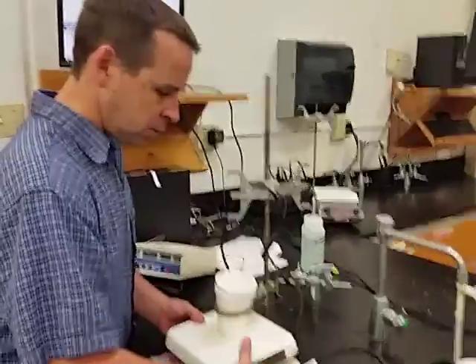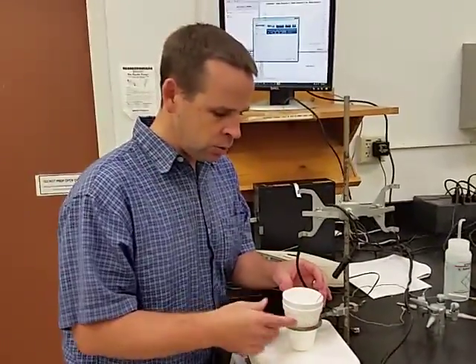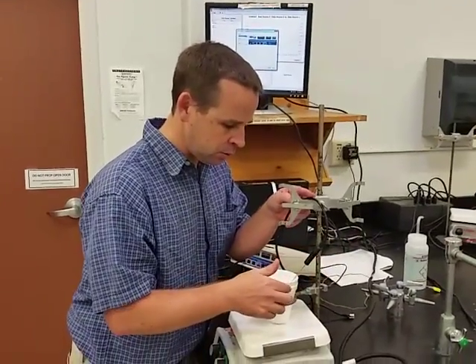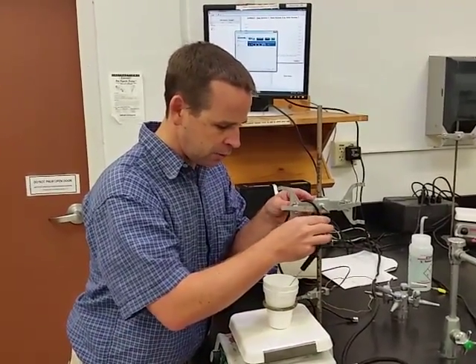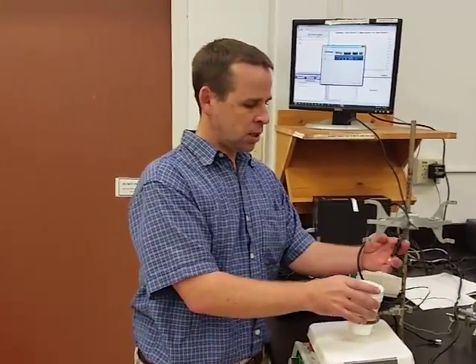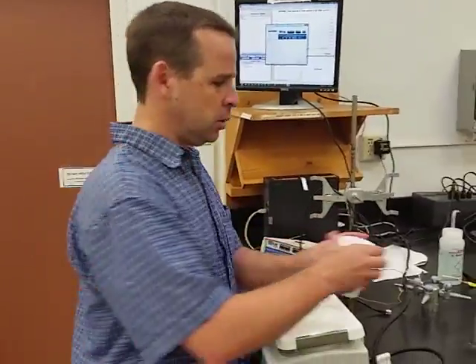Stir plate. We have two nested coffee cup calorimeters here, two styrofoam cups. We have a thermistor monitoring the temperature. Inside I have a stir bar, right? We start off with no water in there.